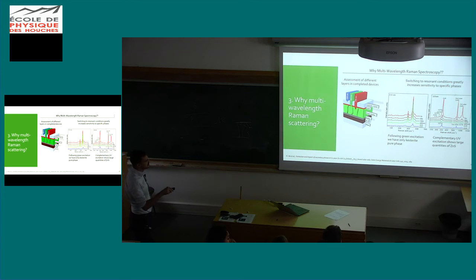These are exactly the same samples. We can here detect zinc sulfide, and even the kesterite signal is very small. We are really enhancing the zinc sulfide signal. And we can observe how our etching process for zinc sulfide is very useful. So in 300 seconds, we have almost no zinc sulfide, or very tiny quantities of zinc sulfide.